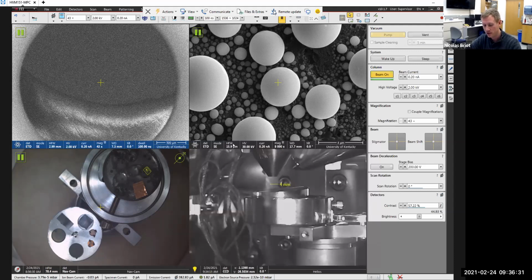If some of you have used XRD, you know a little bit about how the X-rays of the XRD are generated. It's actually the same way we generate X-rays here. You have an electron beam that hits a material, typically copper in an XRD, and it creates copper X-rays, and then we use those to do X-ray diffraction. Well, here we don't go all the way there. We just have the electron beam. When we image, it hits our sample, the unknown, or maybe we know what it is, or we want to analyze it, and then we get the X-rays from the sample, and that's it. We just see what's in there. So that's the idea.